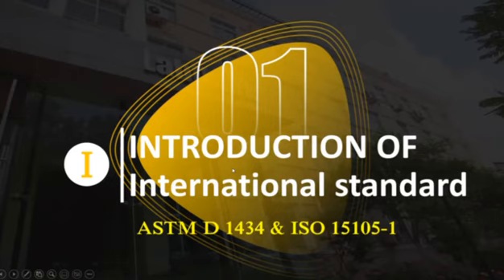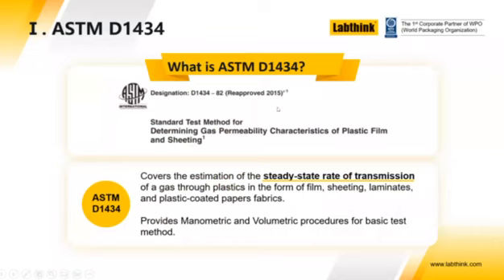So let's look at the standard to start with. In fact, there are two major standards. One is ASTM D1434, and the other one is the international standard 15105 Part 1. ASTM D1434, its official title is the standard test method for determining gas permeability characteristics of plastic film and sheeting. It's a very old standard.